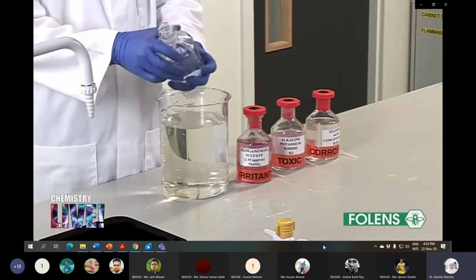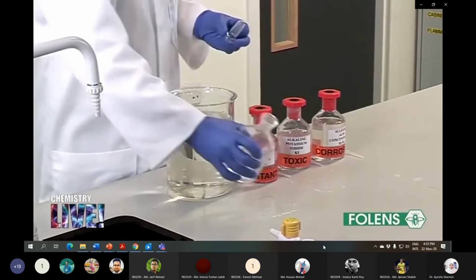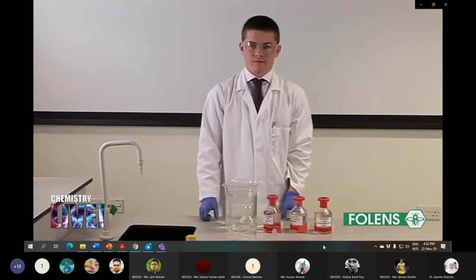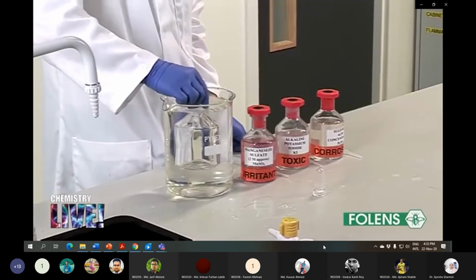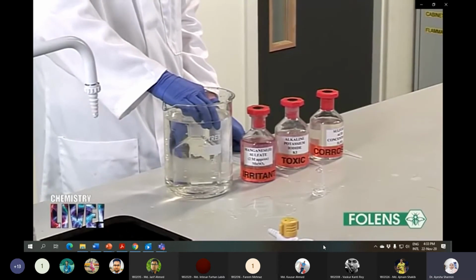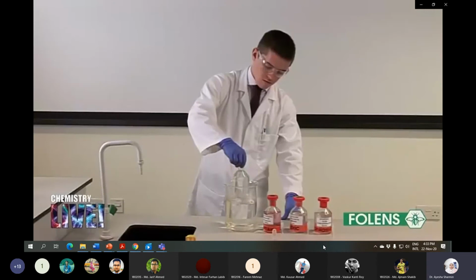So first he is rinsing the bottle with the sample water. So you are submerging the total bottle inside and let it fill out and remove all the air bubbles. Now you'll put the stopper on it.